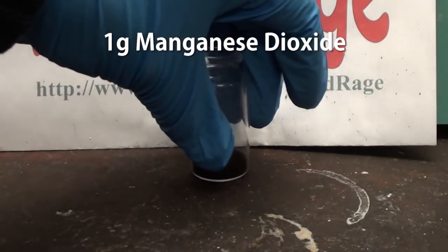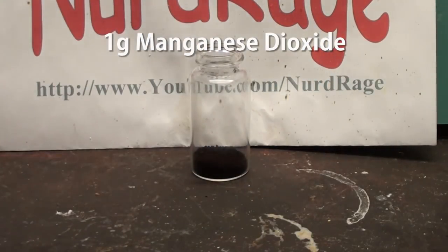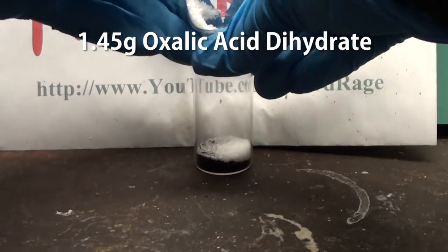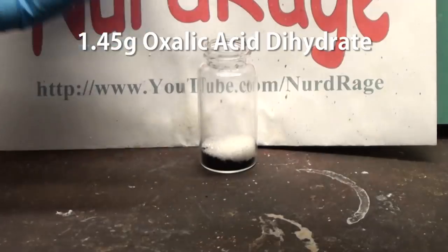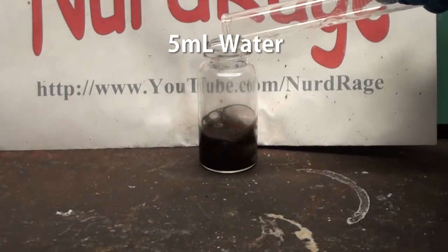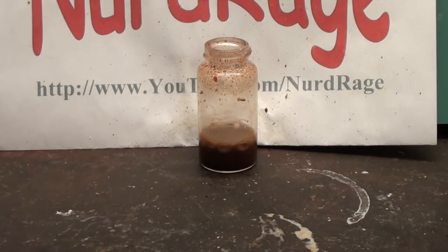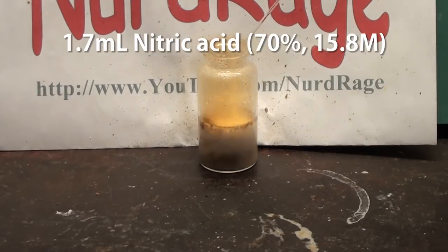Take one gram of highly pure manganese dioxide that we made in a previous video. Now add 1.45 grams of oxalic acid dihydrate, then add in 5 mL of water. The oxalic acid will quickly react with the manganese dioxide to form manganese carbonate along with water and carbon dioxide. When the reaction slows down, carefully add in 1.7 mL of nitric acid a few drops at a time.